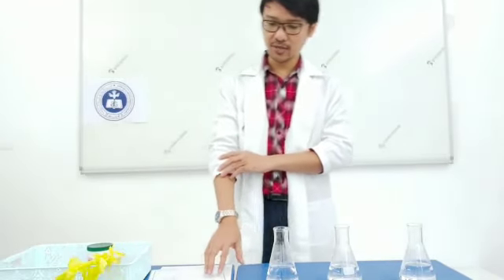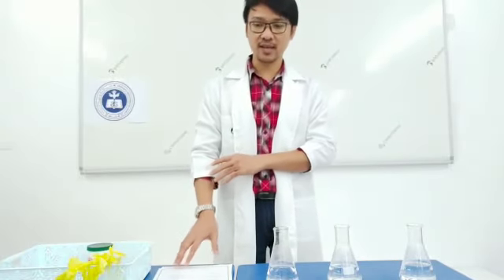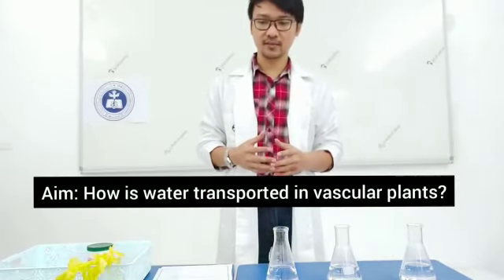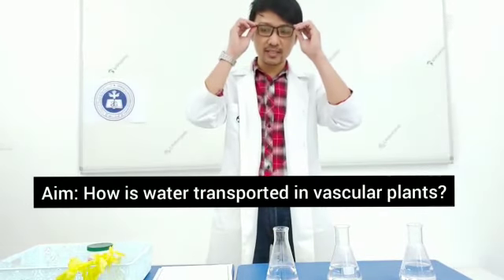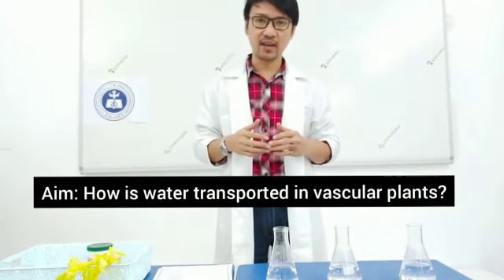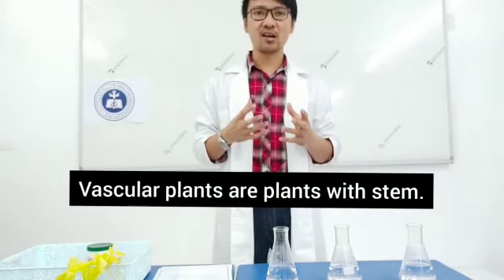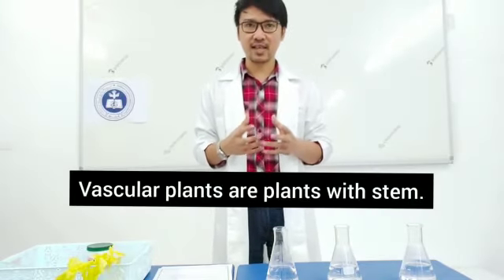Okay, so for our experiment, we're going to do activity 1, which is on page 3 of your lab manual. So this is all about how plants live. The aim of our investigation is, how is water transported in vascular plants? When we say vascular plants, these are plants that have a stem.